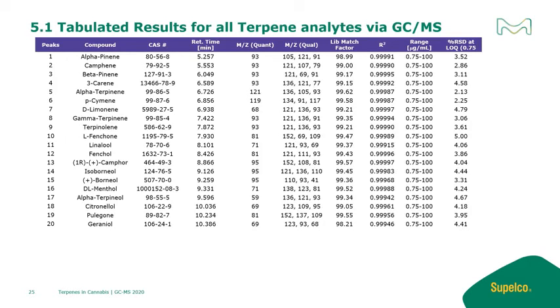In order to achieve these results, it should be noted that sometimes, in order to be in the linear calibration range of your instruments and avoid instrument saturation as well as carryover, you should dilute your samples to low levels. I would top it off at about 250 ppm, or use a high split ratio of 50 to 1 or 100 to 1, depending on the target levels that you're trying to reach in your samples.